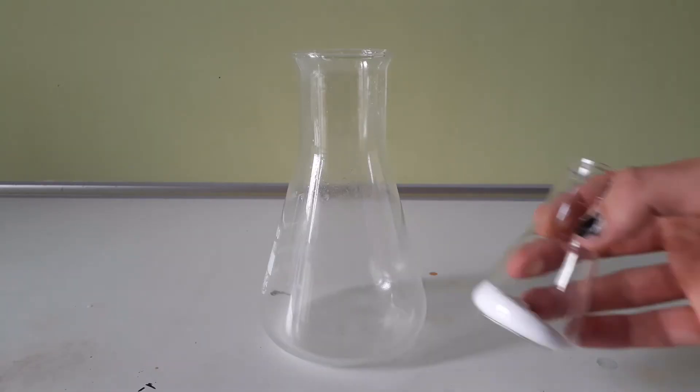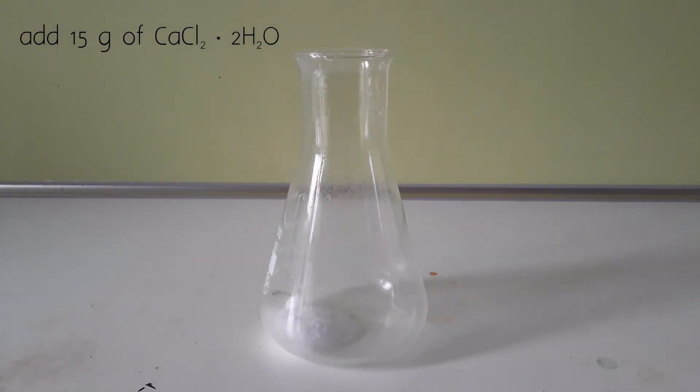To start off, I add 15 grams of calcium chloride dihydrate to an Erlenmeyer flask. This is followed by the addition of 85 grams of 6% hydrogen peroxide solution. This is then placed outside to cool down to about 2 degrees Celsius.